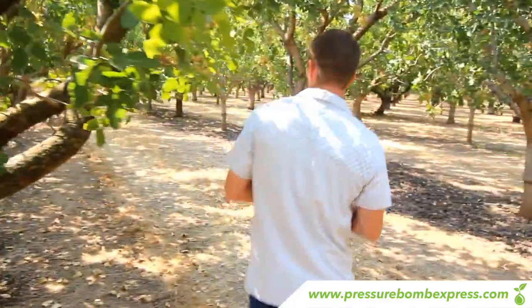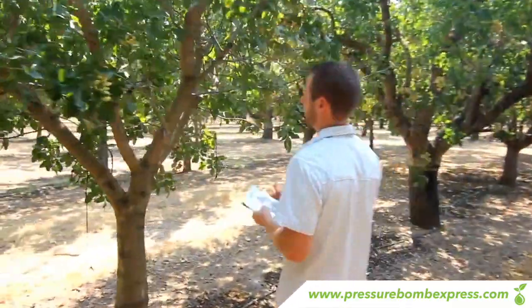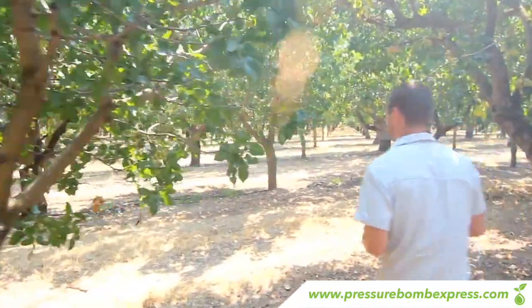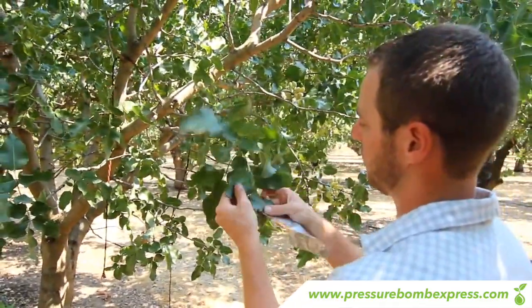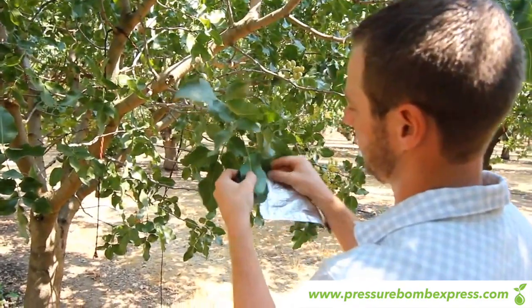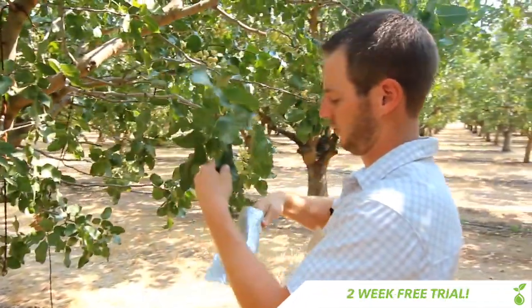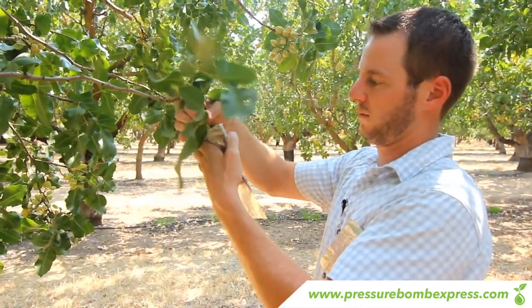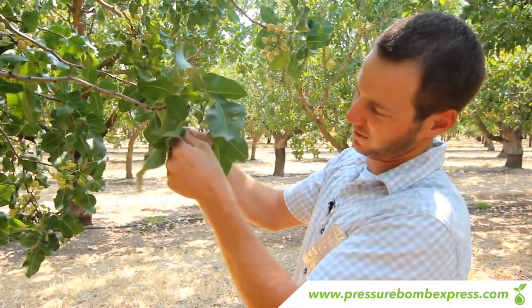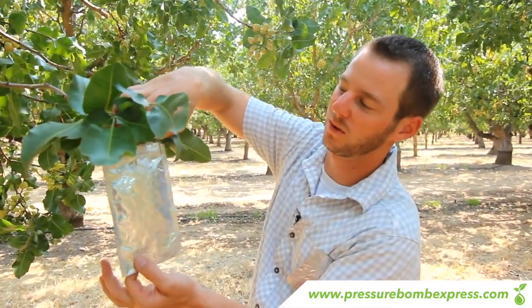From here we'll move on to the next tree and find another healthy branch. You don't want to take too close to the trunk — I tend to take about halfway out from the trunk to the outside of the canopy. We'll find a nice leaf cluster like this one right here. It has a nice long stem petiole. We'll do the same thing: fold over the leaves nice and gently so as not to hurt the stem, then close the ziplock from the outside in. Once it's hanging like this you have a perfect stem to come back and clip when you're ready to take your pressure bomb reading.